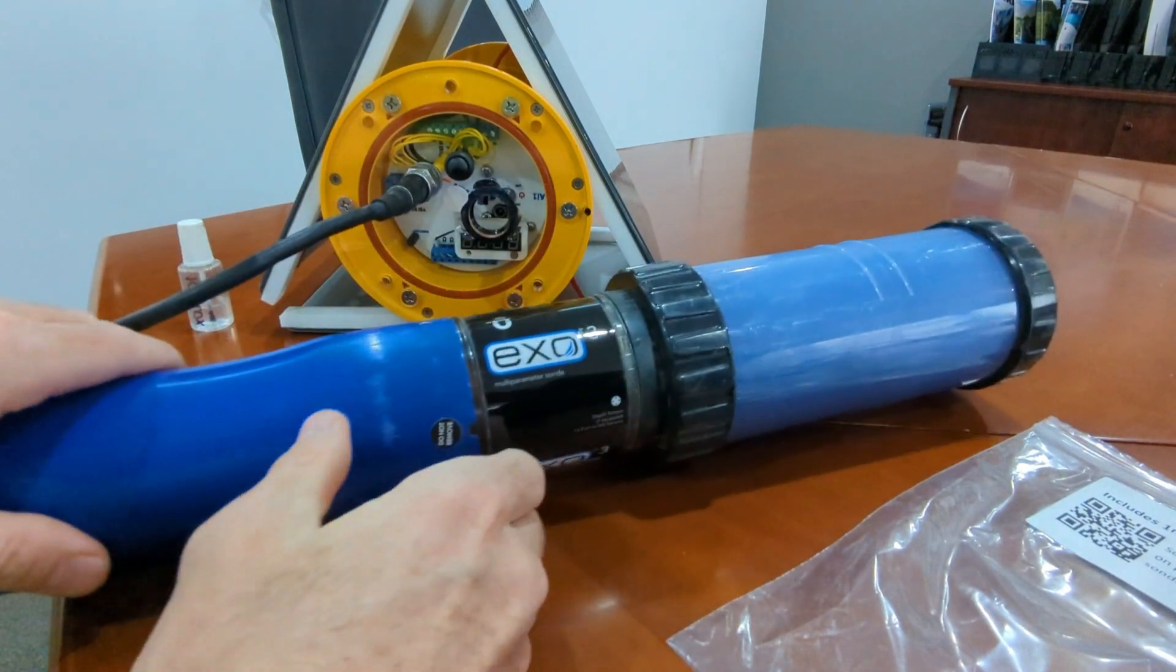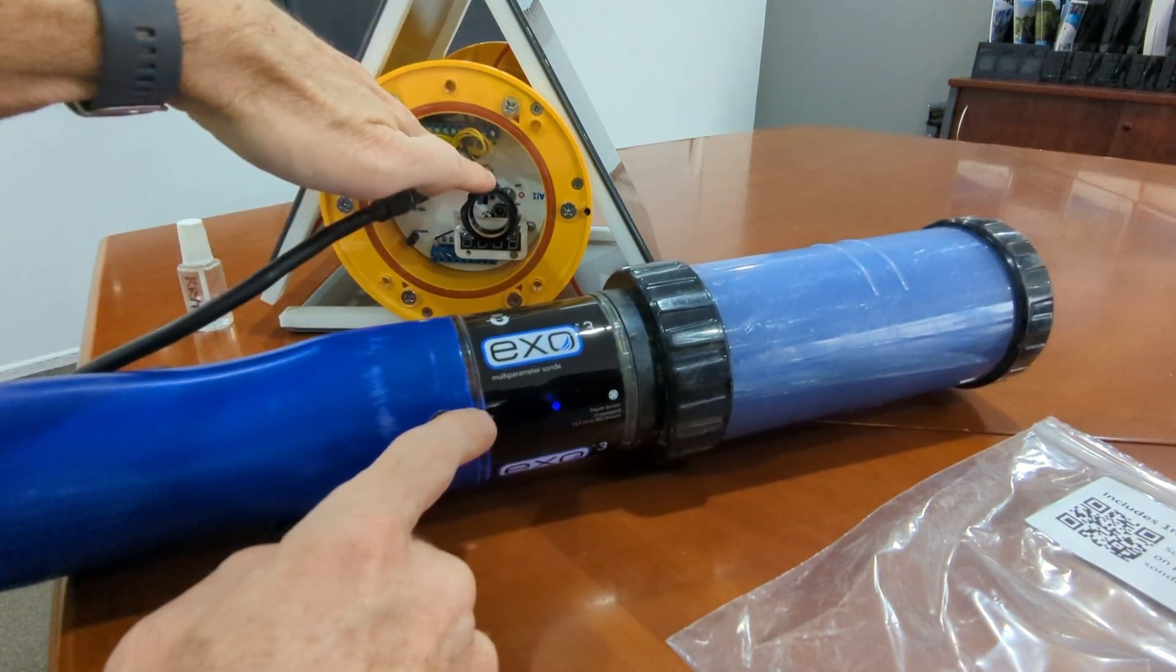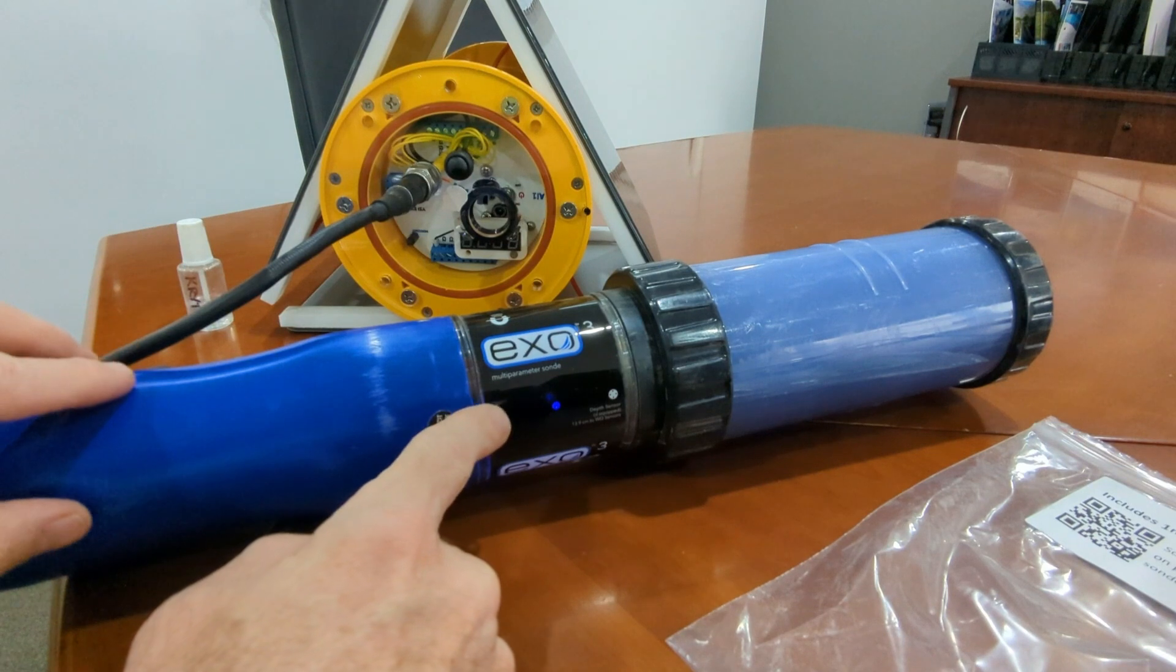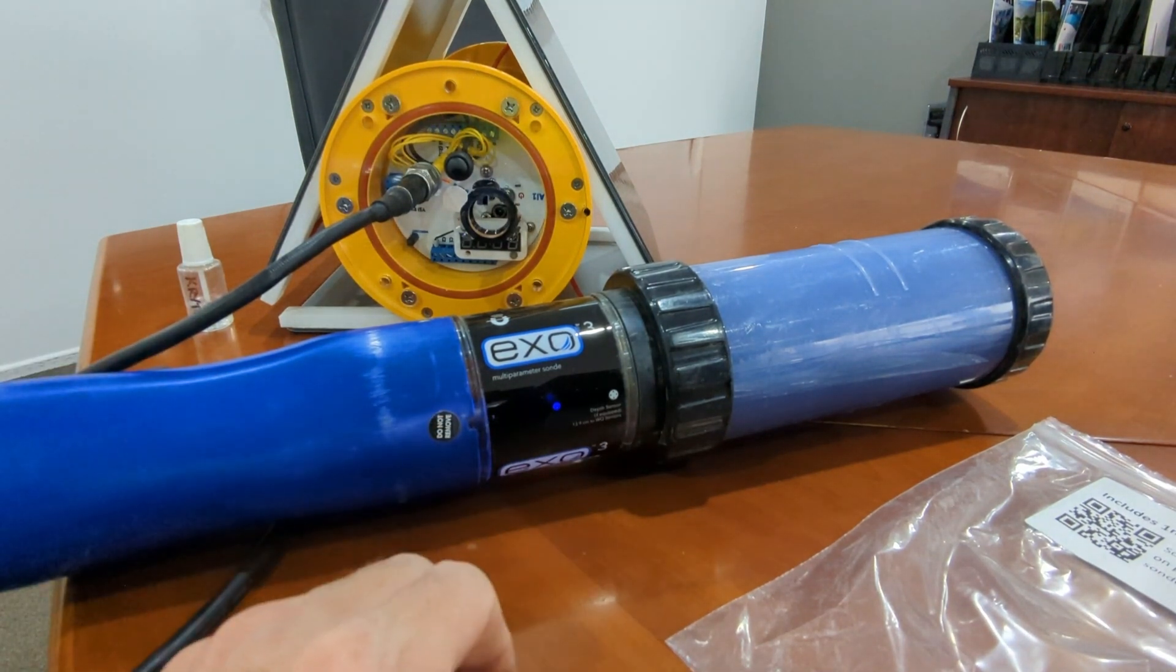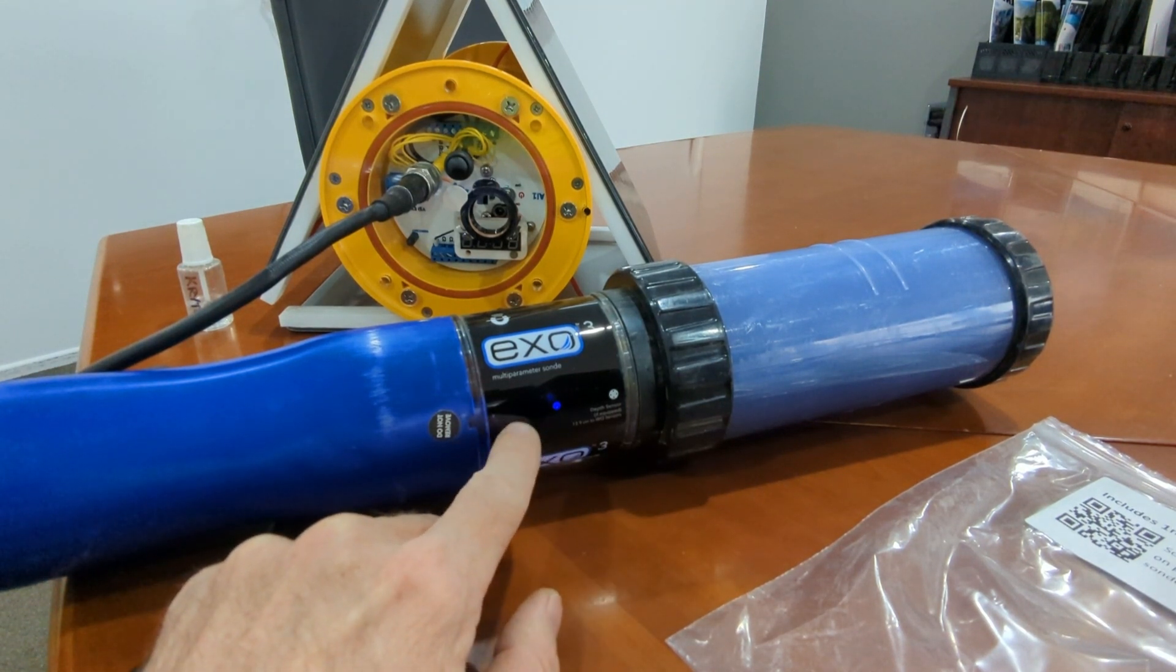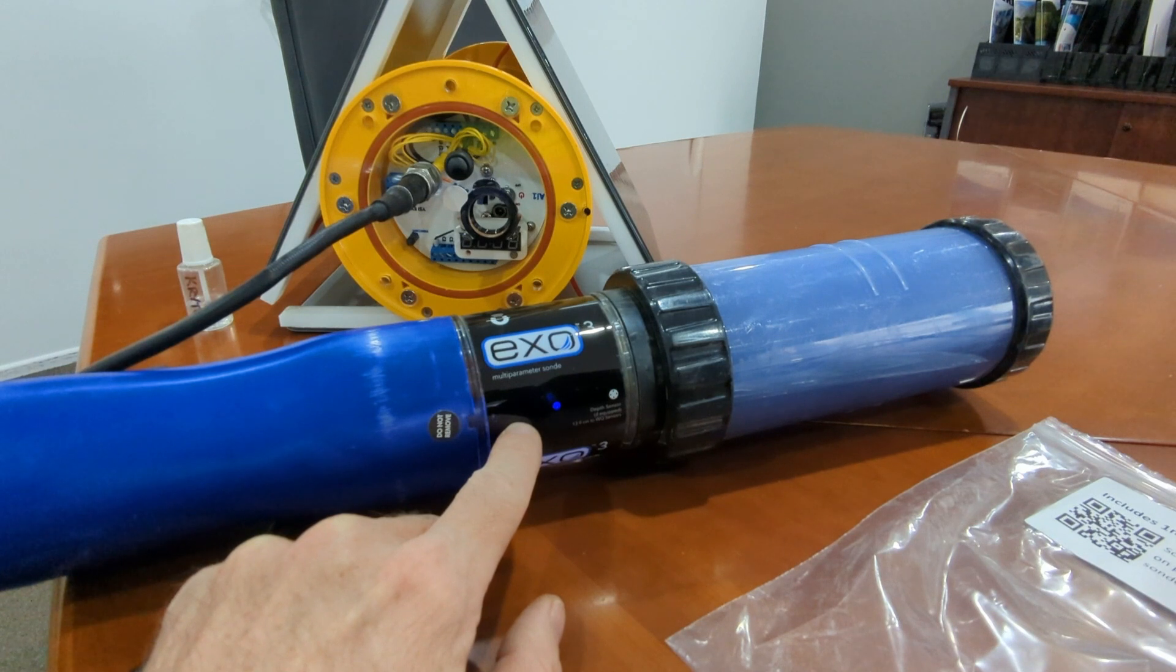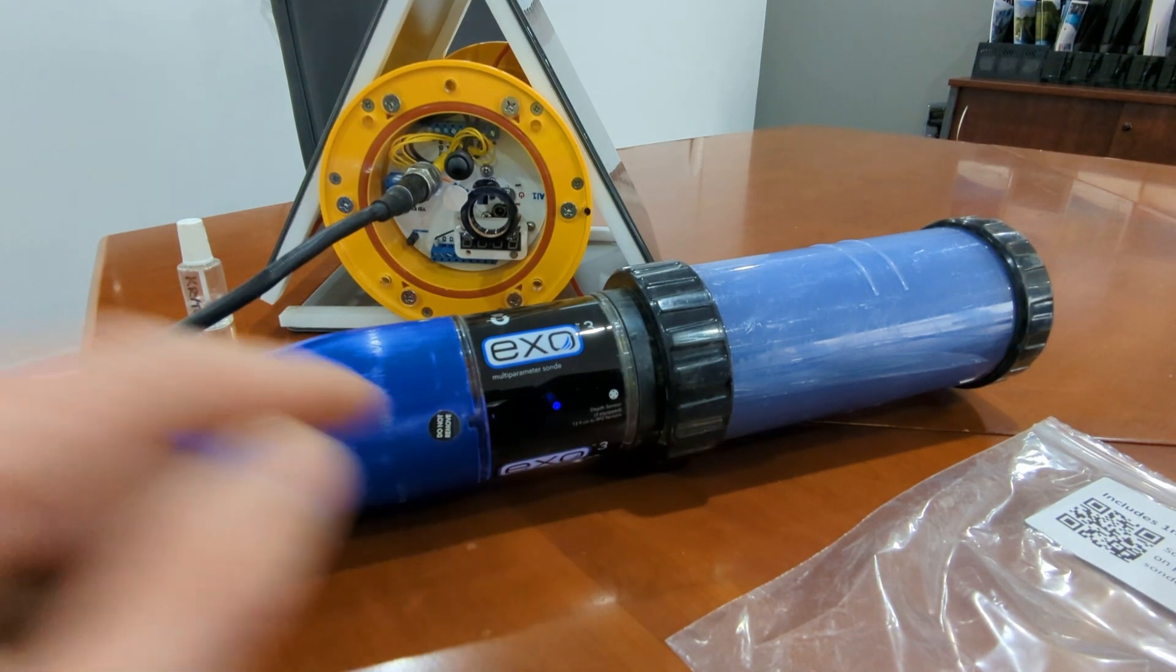Once we do that, assuming the AI-1 is turned on, you will see the LEDs start to light up on the EXO sonde. Once you see the LEDs, you know that you have power to the sonde and you can then use the EXO core software to configure the sensor.